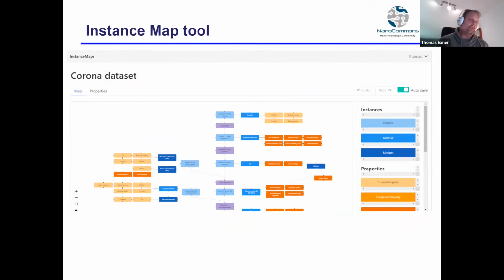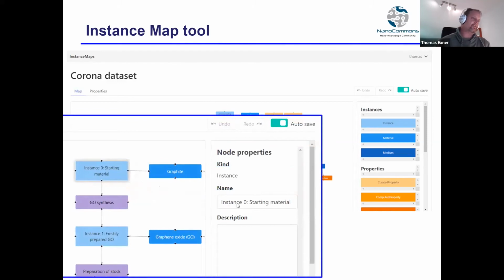This is the tool. This looks similar to what Martin was showing. It's just the user interface, and we will go live in there in a second. But that is just how it looks for a relatively complex thing. You can jump in there and see these different things, the instances, then these protocols showing what actually happened from one instance to the other.